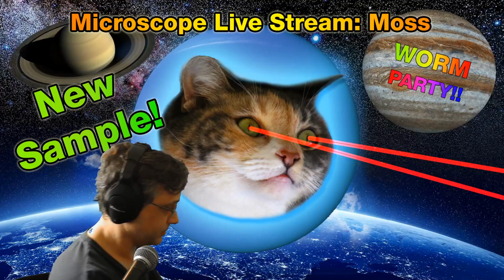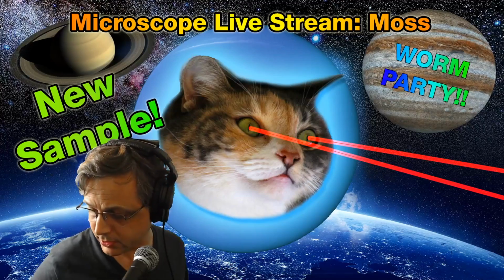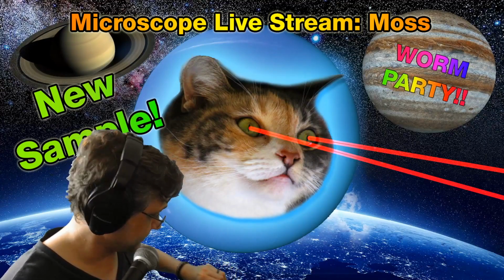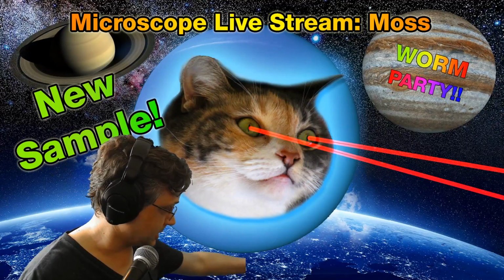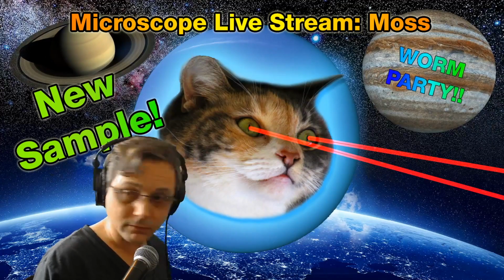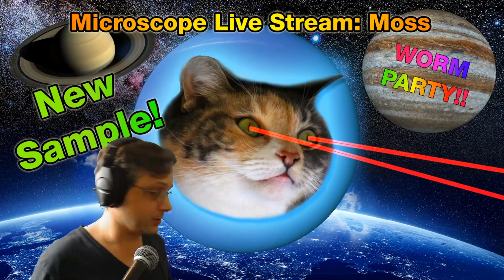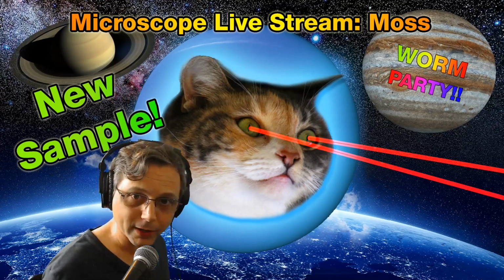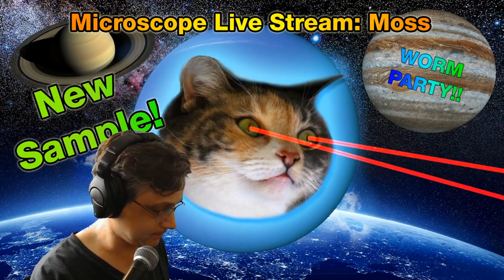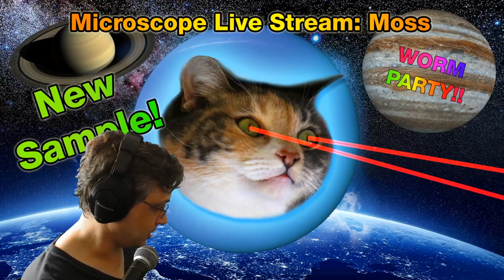If you look at my last stream, you can find it, or we can just load up a slide right now and see if it's still as active as it was yesterday. It's just been sitting in a test tube. I haven't really done anything to it. I haven't boiled any hay or anything, because apparently that's a way you can feed microbes, by boiling hay and feeding them a hay infusion. So I'm just taking some water straight out of this sample of pond water.